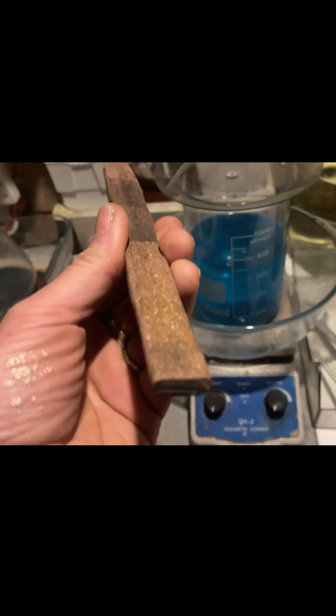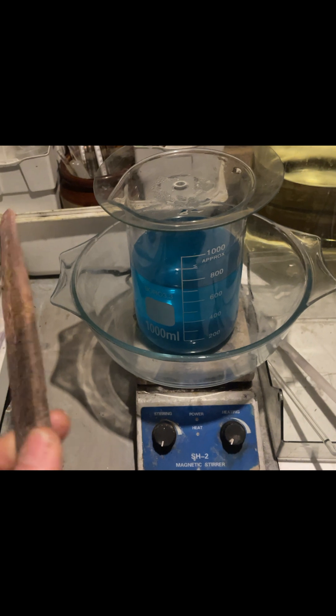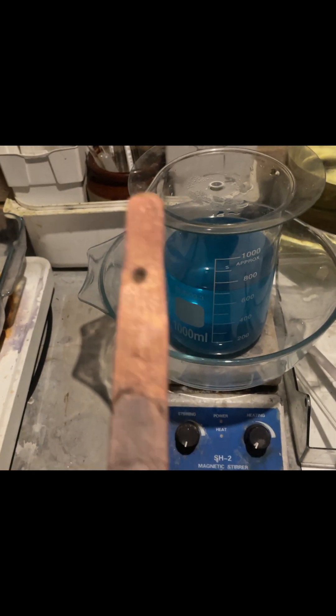I'm gonna use this copper bar — I've been using this for about two years now. As long as most of the nitric acid is used up, you won't lose a lot of the copper.